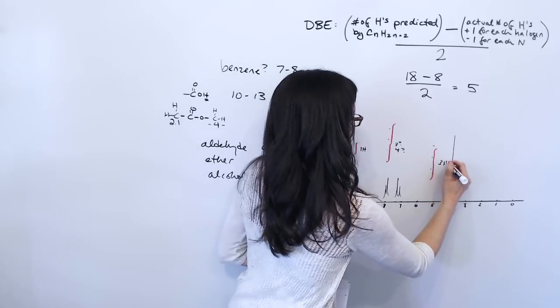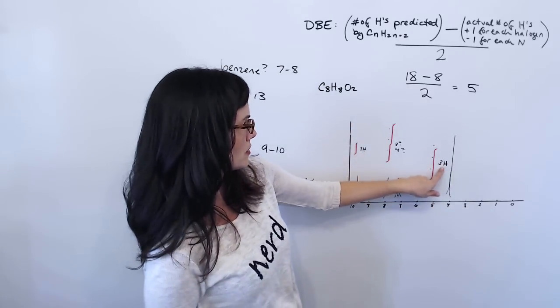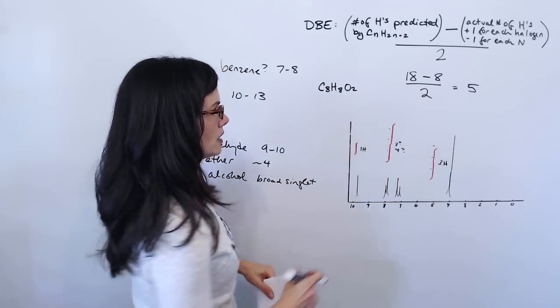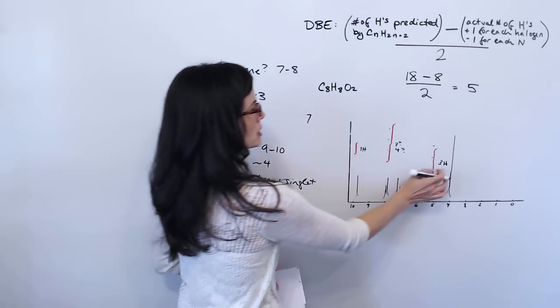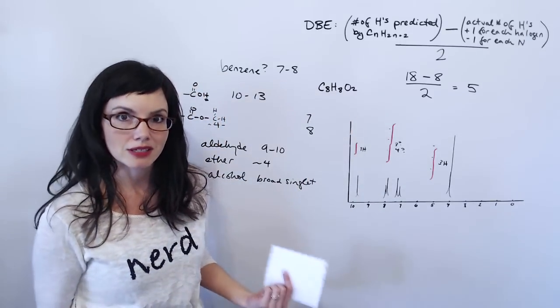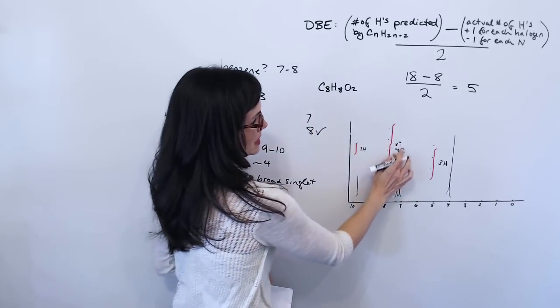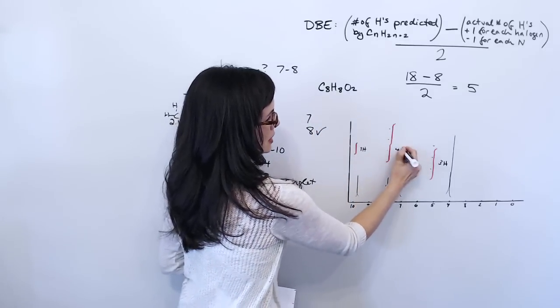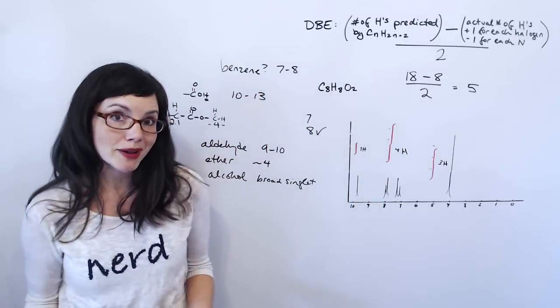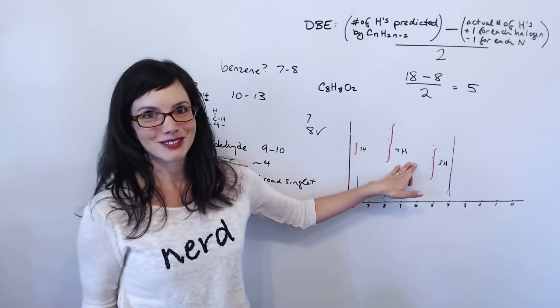So, how do I know how to handle this? Well, 1 plus 3 plus 3 is 7, or 1 plus 3 plus 4 is 8. I have a total of 8 protons in my structure, so I need to go with 8. So that means this needs to be 4. So even when there's some uncertainty in our measurement, we can use logic to figure out what is the right answer.